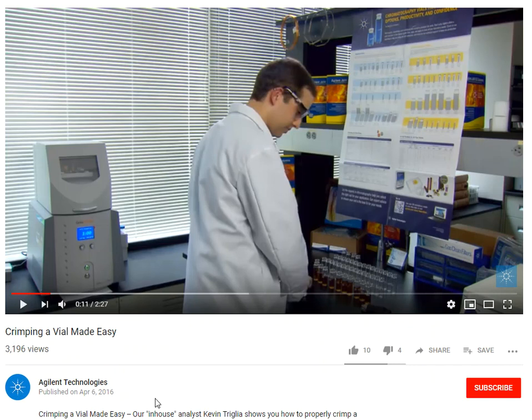Let's say you had 100 sample vials to do. Crimping 100 of these is going to work out your wrist quite a bit. So is there something that we can make our life a little bit easier with in the laboratory? The answer is yes, and that's what this guy's going to show you in that video. So make sure that you watch it and understand what he's doing. I think that you'll like this kind of crimper much better. But guess what? We don't have one of these. We have a manual one, and that's okay because we don't do a lot of sample processing anyway like they would do in a normal laboratory.